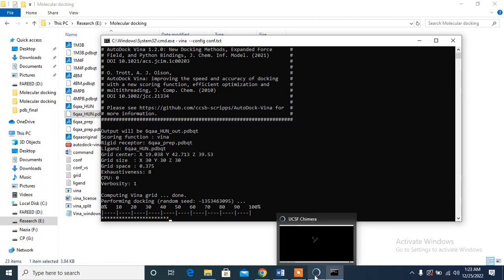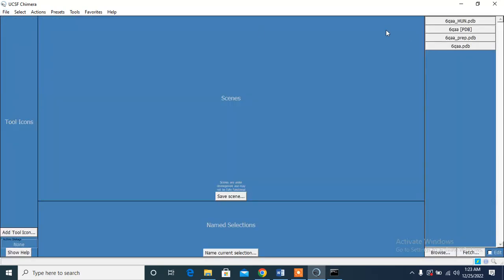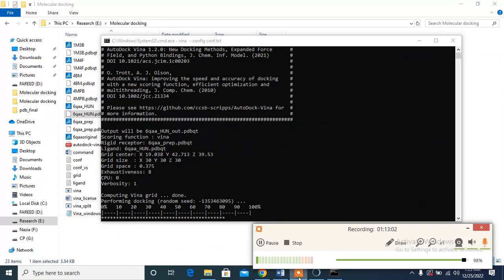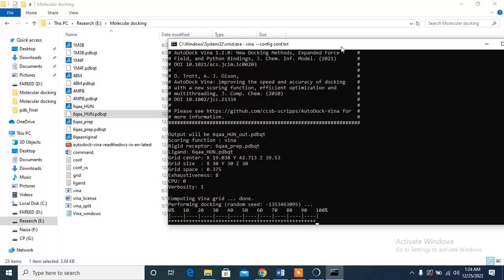Once it is performing, what I will do is... this is Vina 1.2.